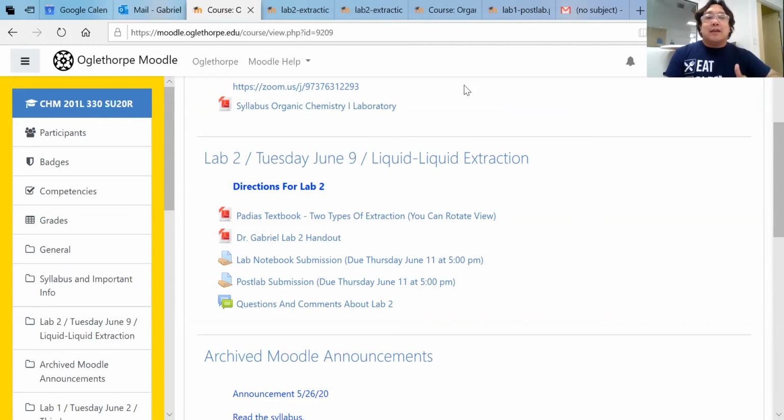You need to say its clarity, fine, clear liquid, but also you need to say its color, because a clear liquid can still be yellow or still be light blue. Clear just means that it's transparent. So if something looks like water, I would say it's a clear and colorless liquid that looks like water. If you could tell the viscosity, you could say it has the same viscosity as water. You want to be very descriptive when you describe these chemicals as we proceed through a procedure.